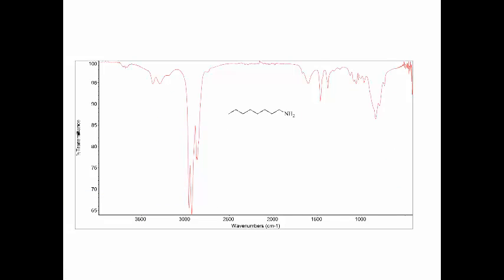All right, this is a classic spectrum of an amine. We have a primary amine here, so we have two nitrogen-hydrogen bonds. So we have two peaks or bands from two nitrogen-hydrogen bonds. So that tells us that we have a primary amine. We also have our peaks immediately to the right of 3000, so we'll draw our line up from 3000, and you can see we have sp3 carbon hydrogen here, and that's really all we need to get from the spectrum.